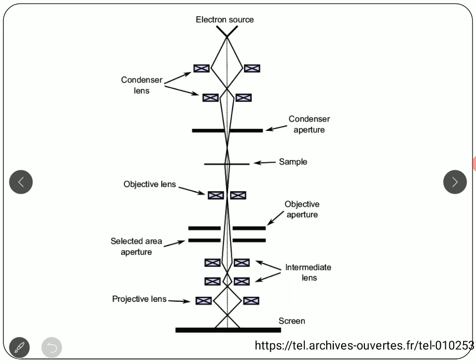But the other parts more or less remain the same. For example, the electron source. Whatever electron source we have studied in case of SEM is similar in case of TEM also. So both are connected, hence we are not going to take too many lectures to finish this part of the syllabus. Probably one more lecture and we should be all okay. So please listen to this carefully. And if I am asking you a question on TEM, maybe regarding the paths, you can refer to SEM and give a similar kind of explanation.